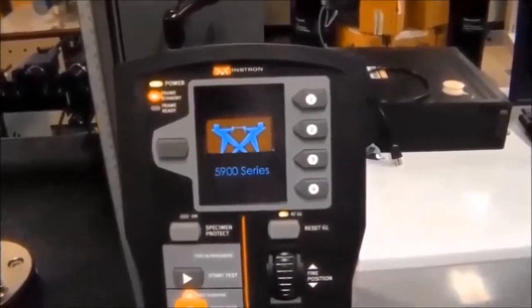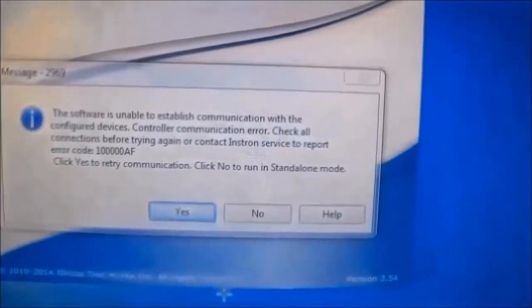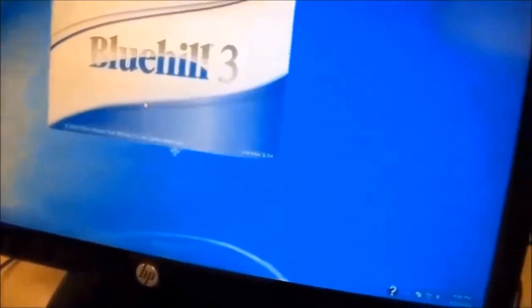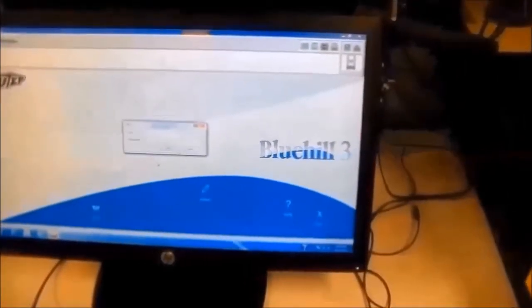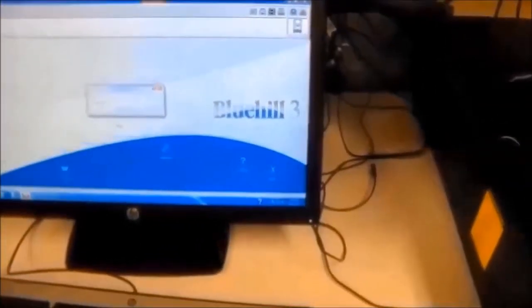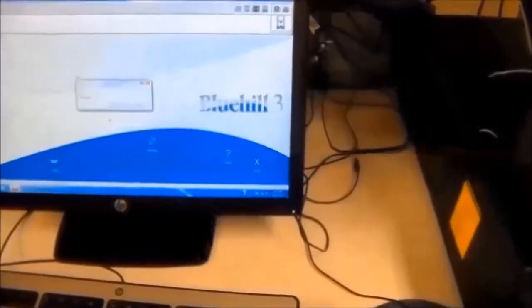Remember, we have to turn on the frame first and then turn on the software, which is called Bluehill 3. When we turn on the software, it may show a dialog that it is unable to establish communication with the device. You have to press Yes and keep trying.